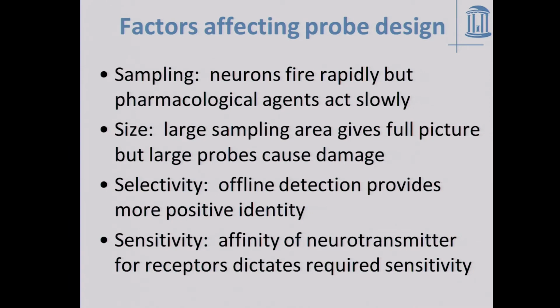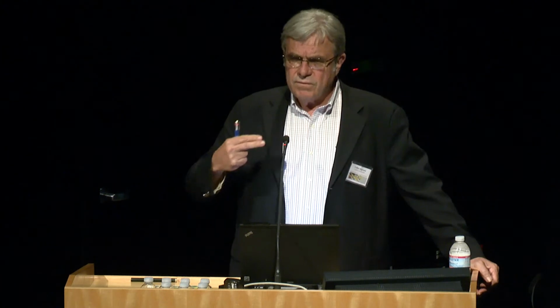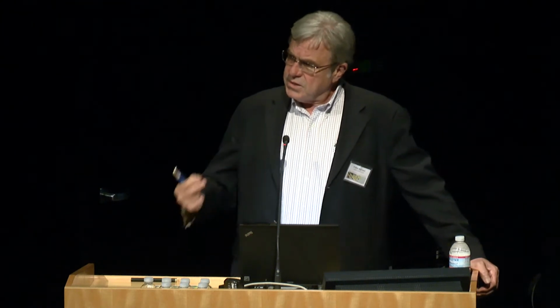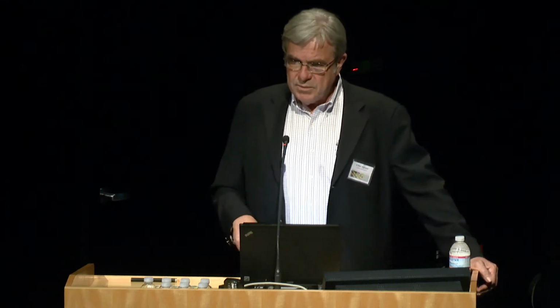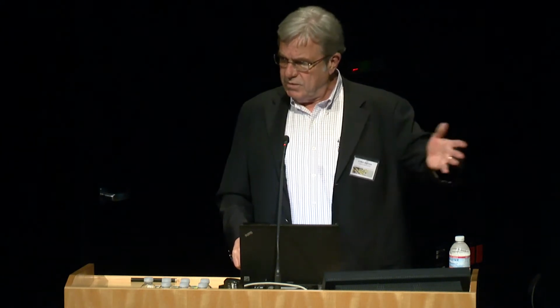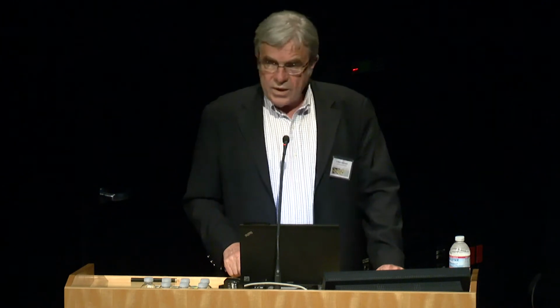We're good today, but the early experiments were really weak, and people were confusing whether they were looking at dopamine or actually ascorbic acid. Turns out there's a ton of ascorbic acid in the brain, and this is a molecule that can be easily oxidized. So if you read some of the 70s and 80s literature, there were violent debates raging back and forth. Is it ascorbate? Is it dopamine? What I'm going to show you today certainly is dopamine.